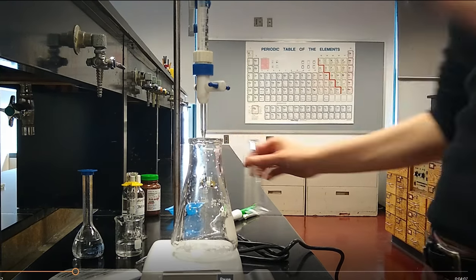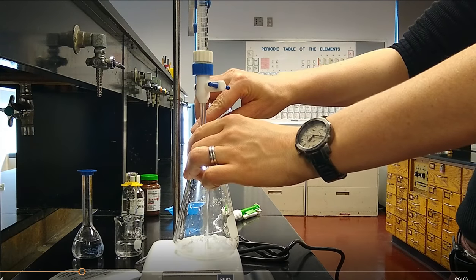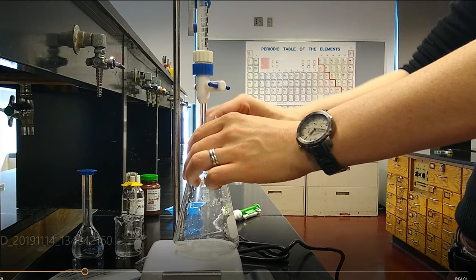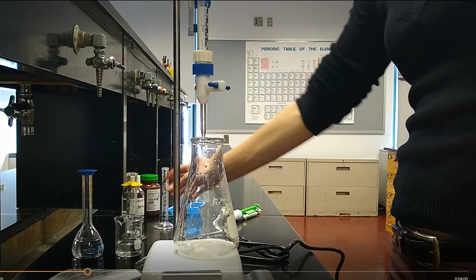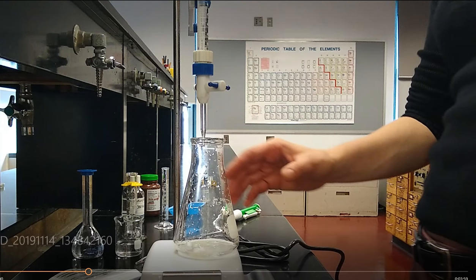You're also going to add sulfuric acid. For the standardization titrations you need five milliliters of one molar. Again, this also does not need to be carefully measured. It needs to be roughly five milliliters. There is no benefit in agonizing over getting exactly five milliliters. Anywhere from four to six is going to be totally fine. This reaction takes place in an acidic medium, so the H2SO4 is just providing an excess of H plus ions for the reaction.